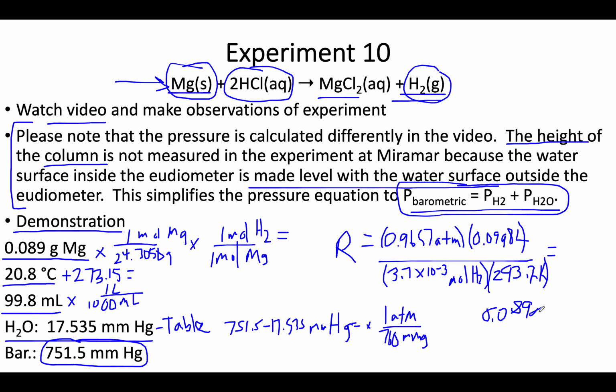You can get pretty good results on these, and again, wanting to emphasize the correct units. That's per mole K, but the main takeaway is that this constant can be experimentally determined, and that's what this experiment does. You've solved for R that you'll be using over and over in these gas law equations. So take a look at the experiment, and if you got questions, come see me during office hours.